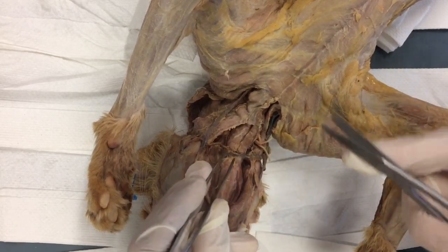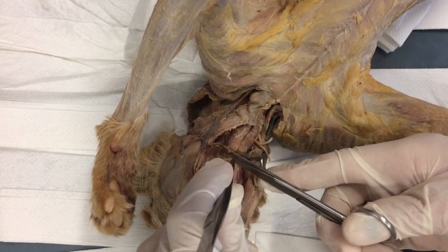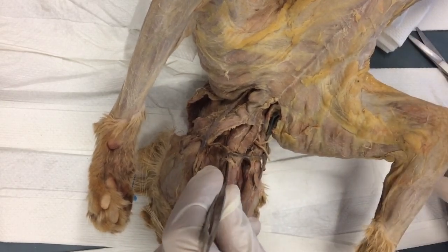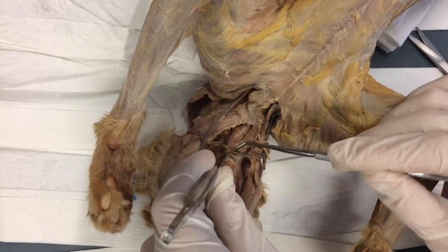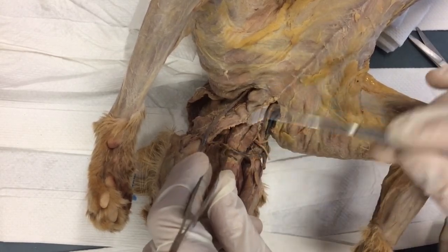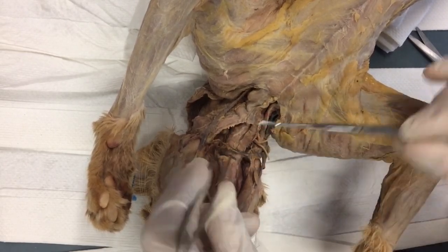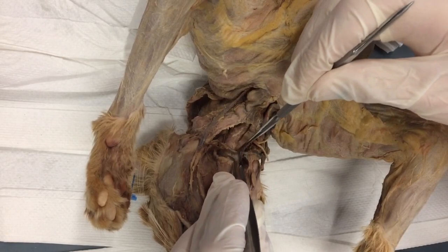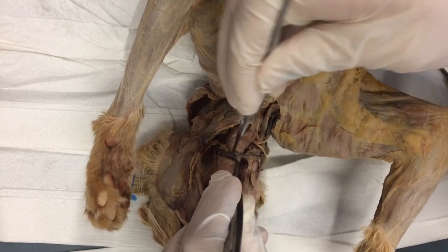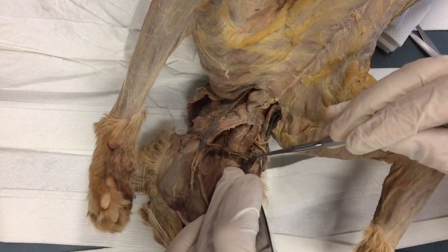So watch. Sharp side down. I'm going to disconnect this tendon the whole way. Don't cut anything underneath. Now you can just see I'm using the round side, and this is pretty easy. There, I just broke that side. Now I'm going to come over here, slip this in there. I should be able to, oop, there you go, just tear it a little bit.